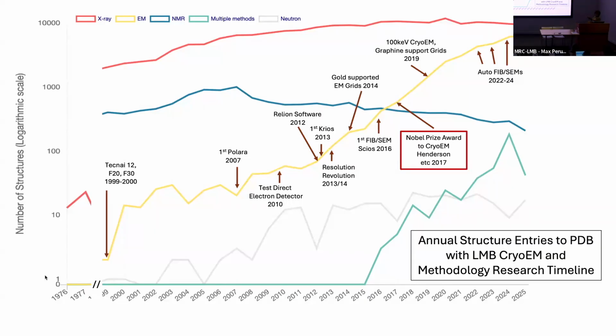It's a new generation plasma FIB machine, so it can do things automatically like the cryo-EM, which was introduced 12 years ago. So we hope this is another takeoff of this type of specimen. Yeah, so this is to give some facts about cryo-EM.